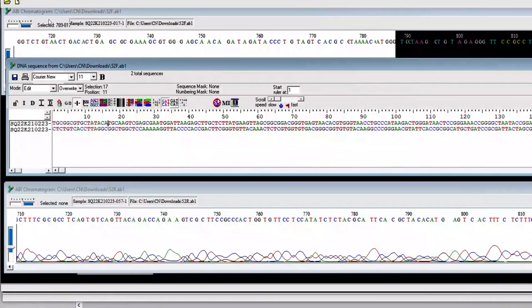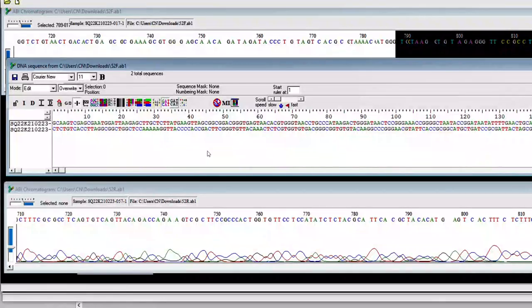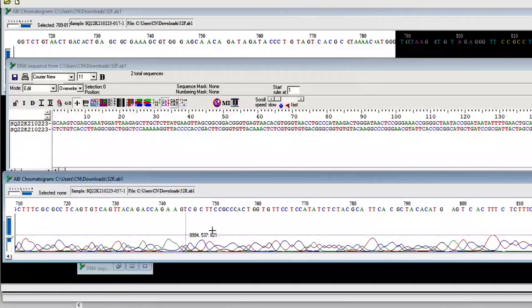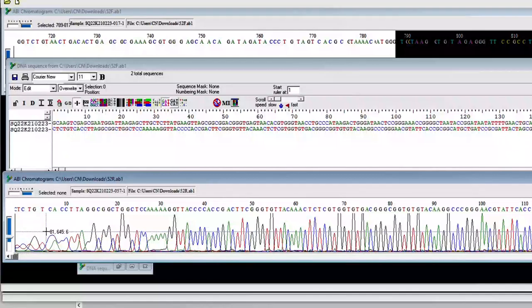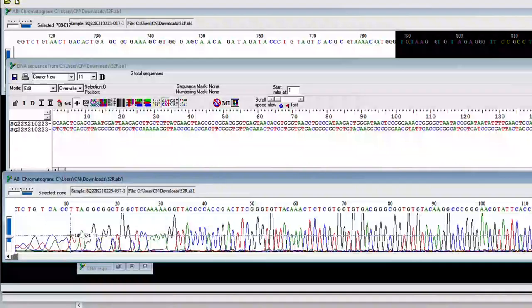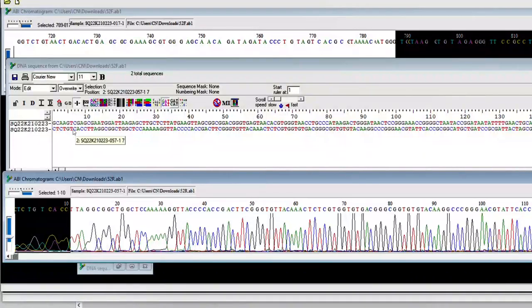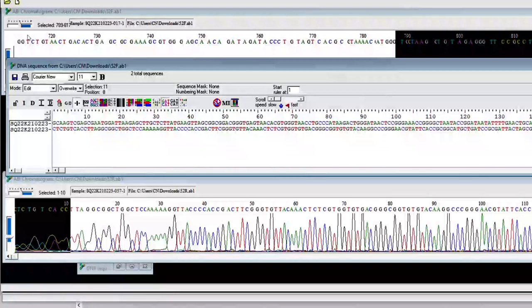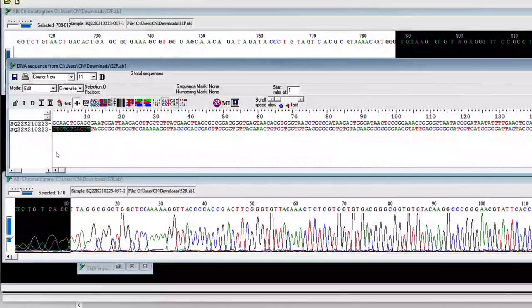Position 17 — select the beginning, Edit, select the beginning, press the Edit button. So we shall also trim the reverse. When we come to the reverse, we can see a poor-quality nucleotide — it is at point 11. We shall drop off this region. We come here to the position marked as DTT, and from there we come to Edit, select the beginning, and we shall cut off that.